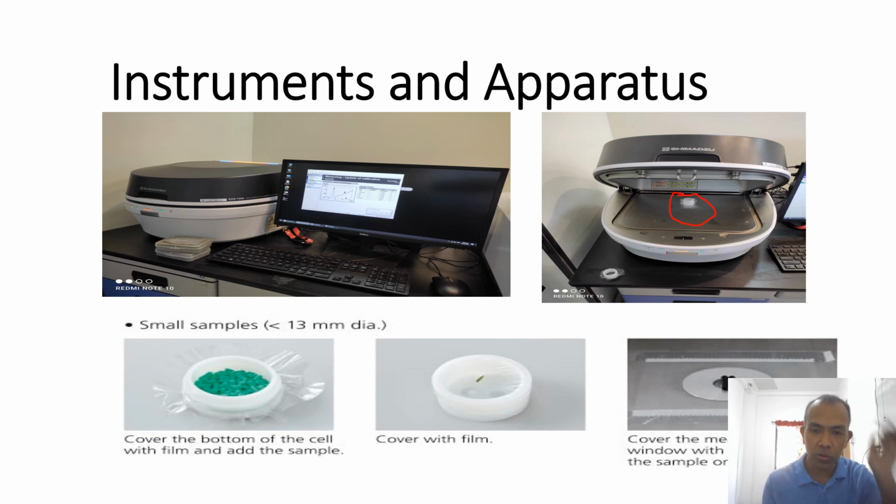This is the sample holder with the film. Tinutwist lang siya, and then you pour half fill of the sample holder, cover with film, and then you put it inside. May slot siya rito. I know meron pa to ibang accessories. You can place multiple number of sample holders, but here we just use one kasi konti lang na inanalyze ko.